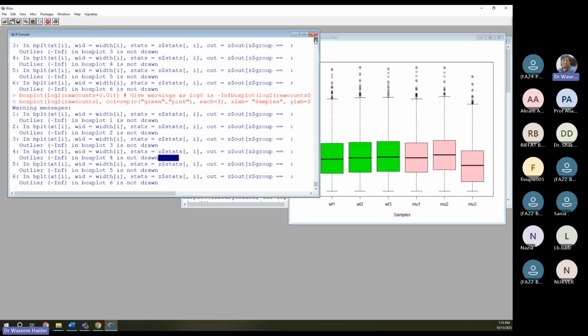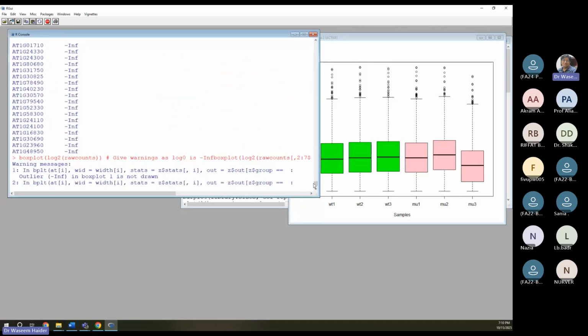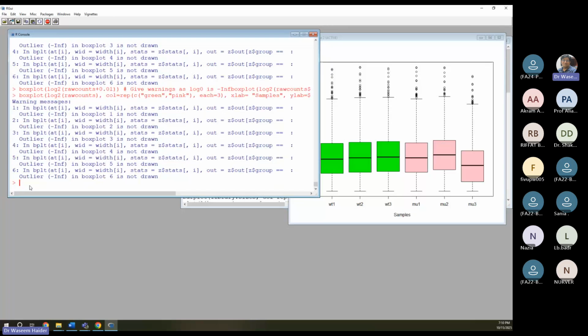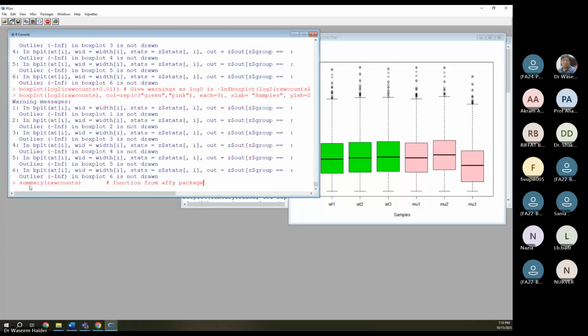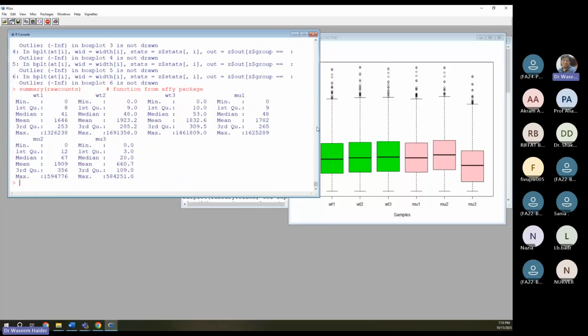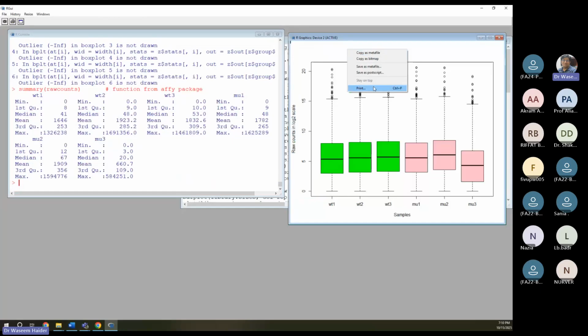The actual data was here in that function. I can recall that function because I did that log transformation thing, so it went up. So the numbers and the pictures, right? And then you can go to that picture and do save as, you know, postscript or metafile or bitmap, and you can save it. So you can save it as, you know, PDF.